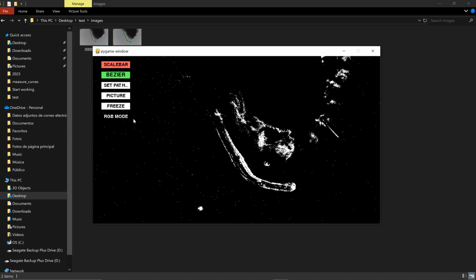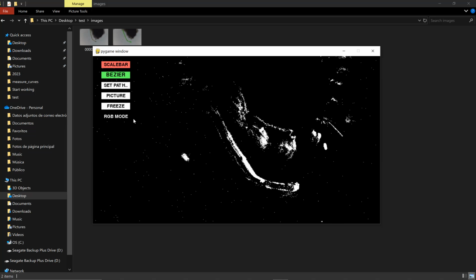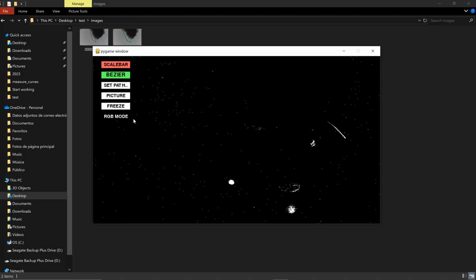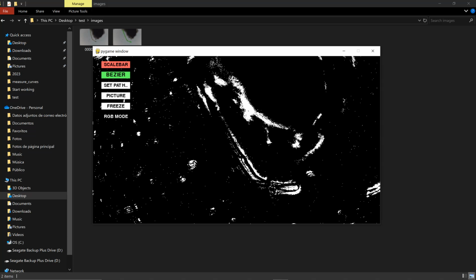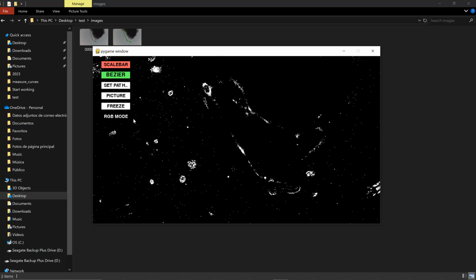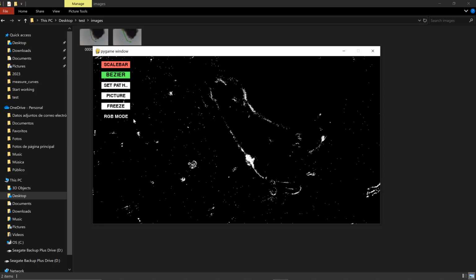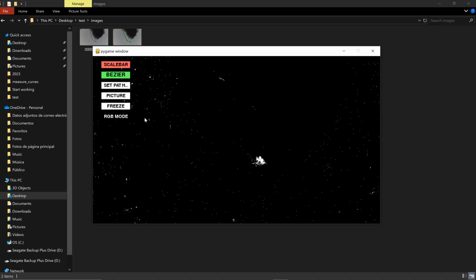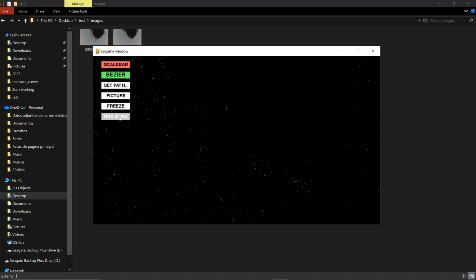You can see that a value of a background is calculated or averaged over multiple frames. Anything that I do in the microscope that is otherwise static, like for example changing the elevation in the z-axis, will reveal the edges of my specimens, which is particularly useful for some scenes that are particularly dark or hard to detect. This filter that works at the level of individual pixels is quite useful. To go back to the original image, you can click RGB mode.